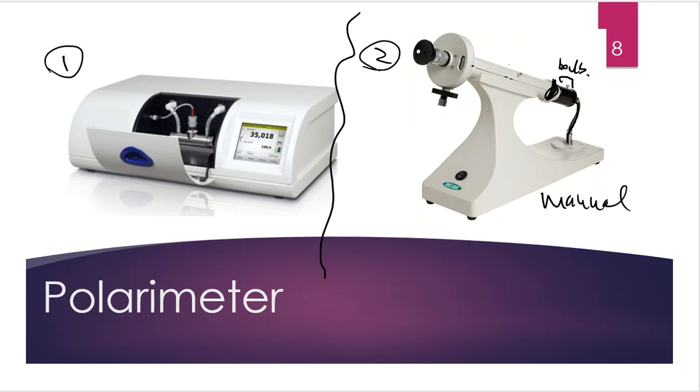And then here, this lid opens, and I'm going to have a really long glass sample compartment. I'm going to fill that sample compartment with my sample, and then I place that long tube inside of the polarimeter, and then I just put the lid back on, and that way it's in complete darkness.